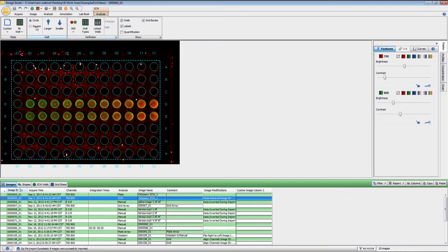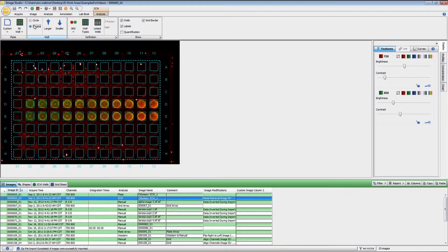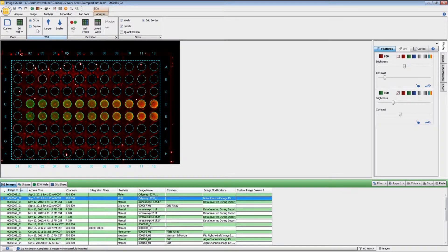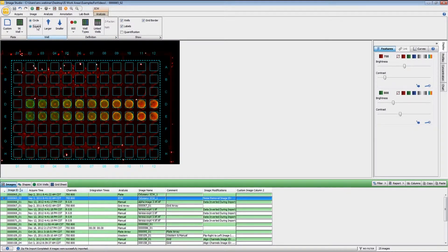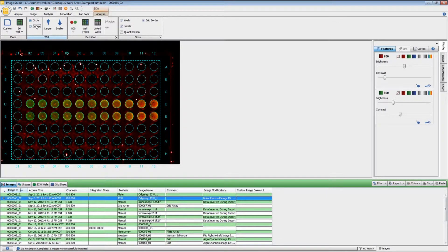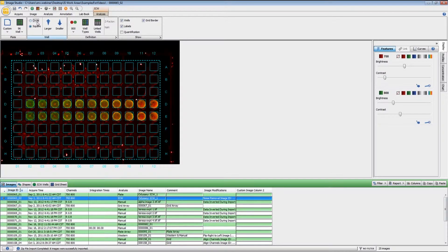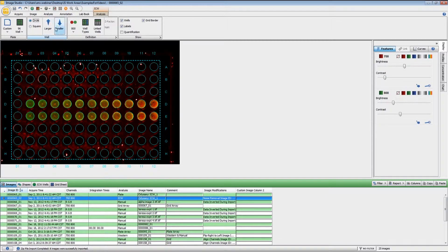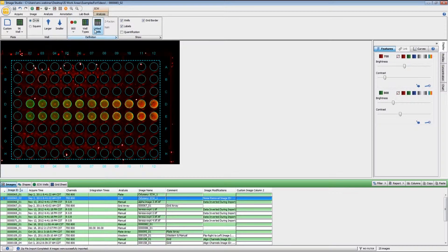Now if need be, you can modify the plate templates — you can do circles or squares. You can make them larger or smaller if need be, depending on whatever your particular plate type is.